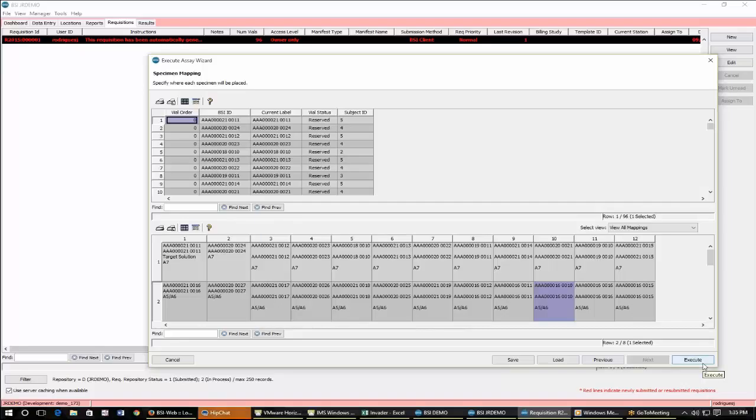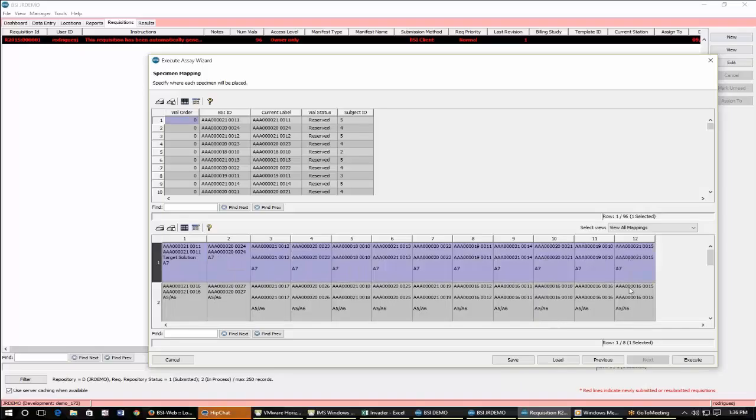I have a question. One of the people that I worked with had a mapping of the fields already, and they wanted to import a mapping. Can you do that? There's not an import option here. Okay. Were they importing like this vials and like this one?